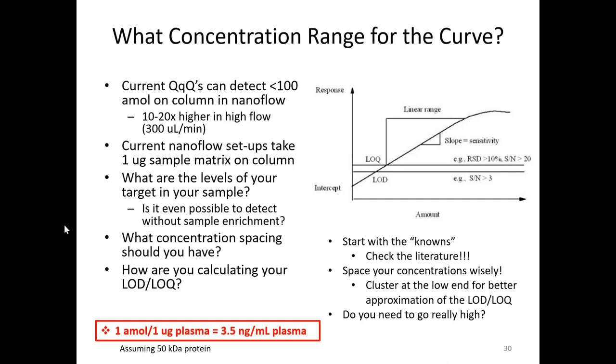And that's not incredibly impressive, I think, from a clinical standpoint, nanograms per mL. Nothing really exciting is at that concentration, right? Some proteins, yes. But this is at the very low end of what we can detect, and that's 3 times lower. So this is why we have to do a lot of sample enrichment and other things in order to detect things that are interesting.